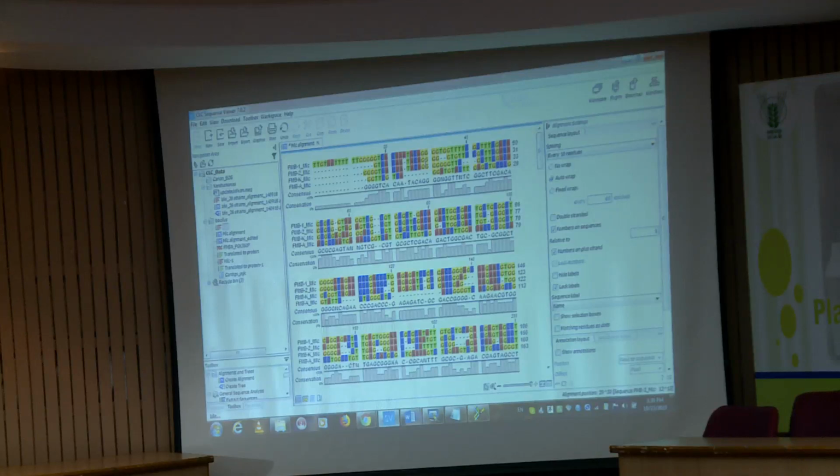So, we can trim that region to avoid any confusion about what that base is. If I am sequencing around 600 bases, at the end around 500 will be in my hand. I will chop off another 100 to 200 bases from both ends. Whenever you are designing the primers, you consider what actual sequence you want. You always design the primers 200 base pairs more than the region you require.